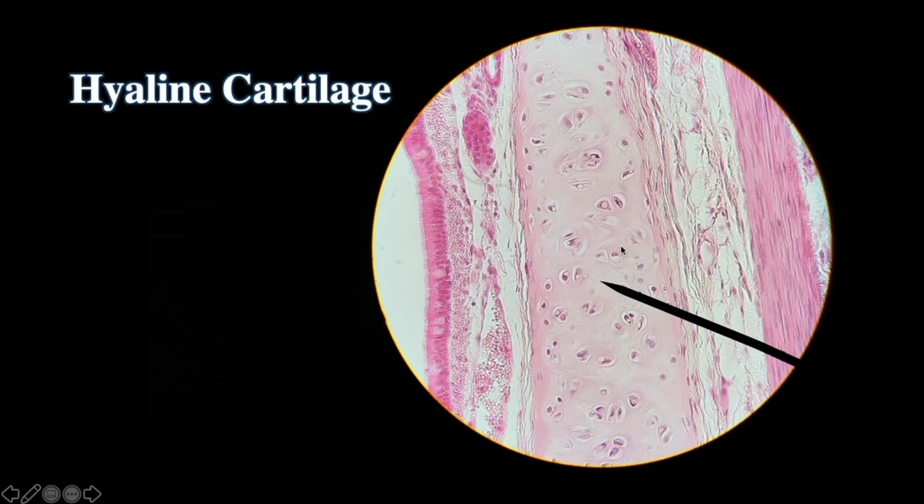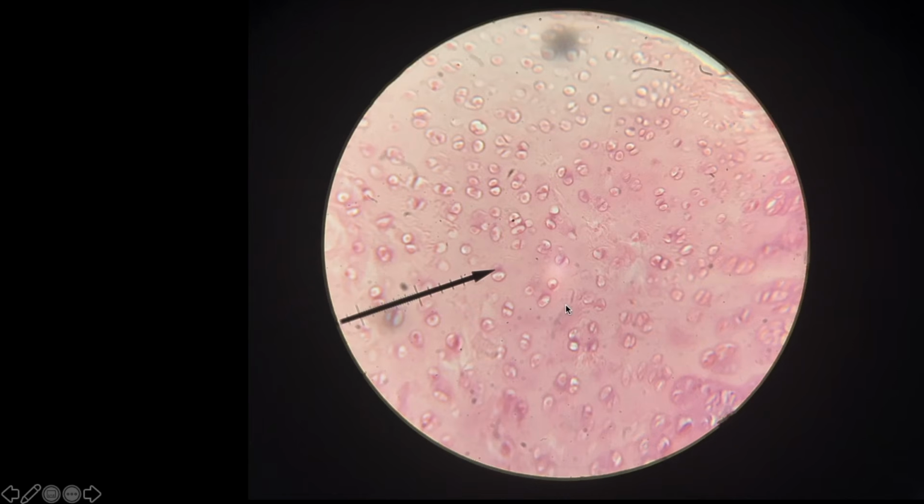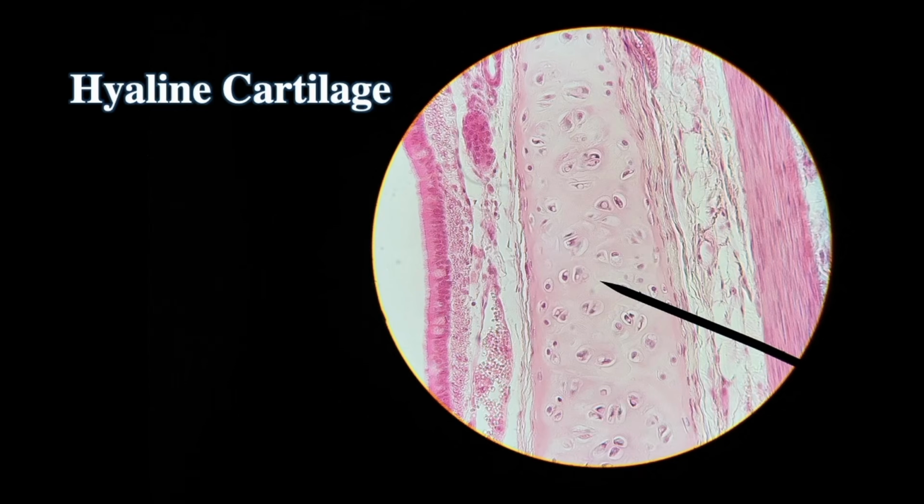How I remember it, hyaline cartilage, you just wave your hand high, hyaline. So your arms are made out of long bones. And at the ends of your long bones, they're wrapped with this articular cartilage called hyaline cartilage. All this is hyaline. And the matrix is very well, let's say this is like a paint. Let's say you mix this up. You don't see any streaks in here. It's very well mixed like a watercolor.